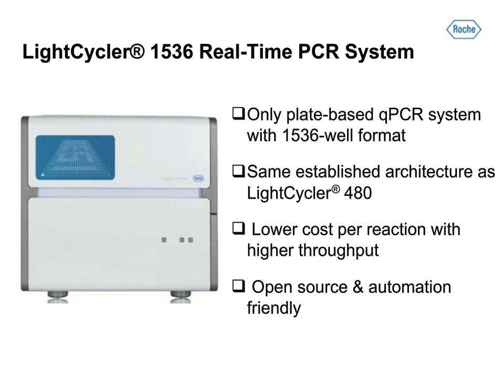Lower cost per reaction: you are basically reducing the reaction volume. The maximum volume that you would be putting in the 1536 well is around 2 microliters, which helps you in two fashions. One would be high throughput, which maximizes the number of molecules that you want to screen, and also it reduces the cost of the reaction.